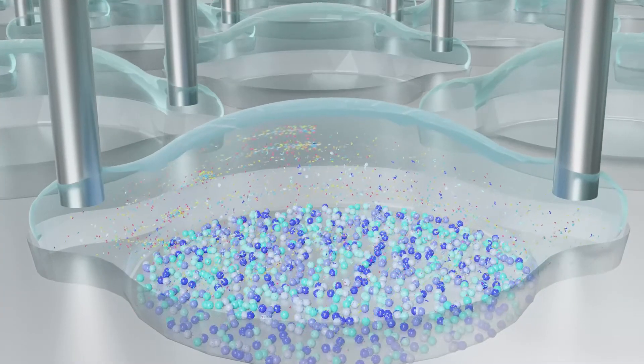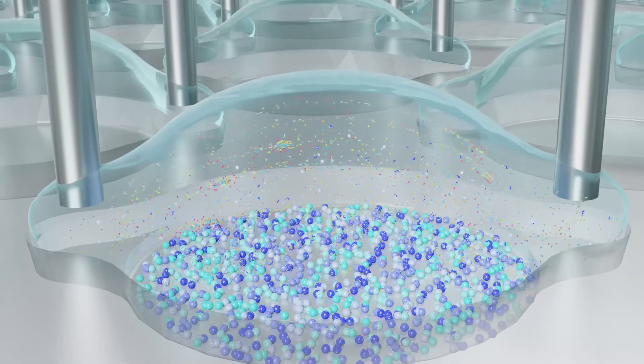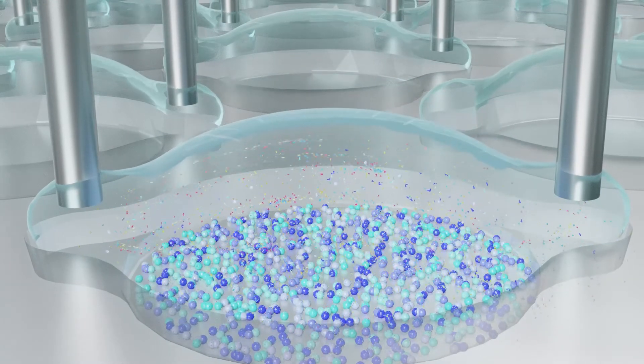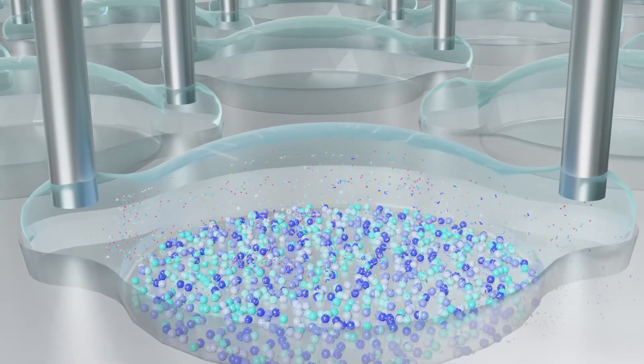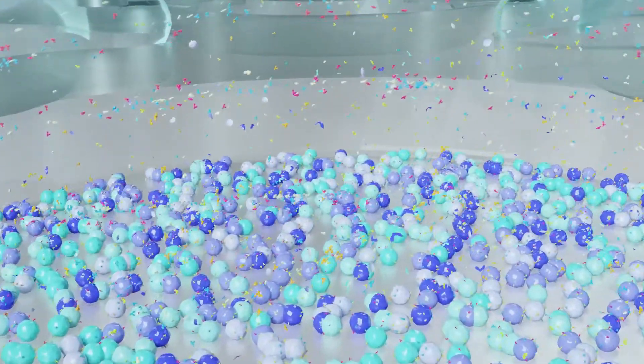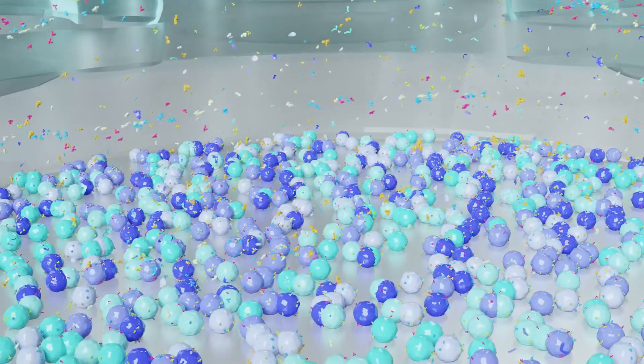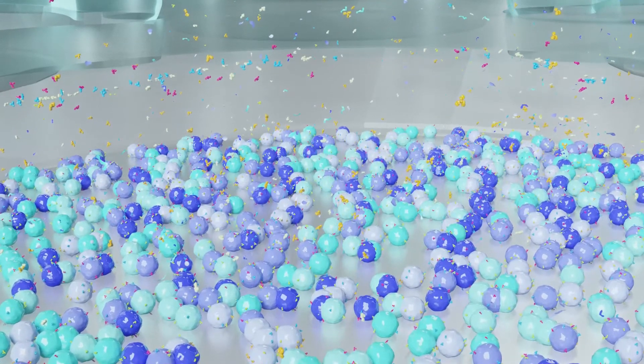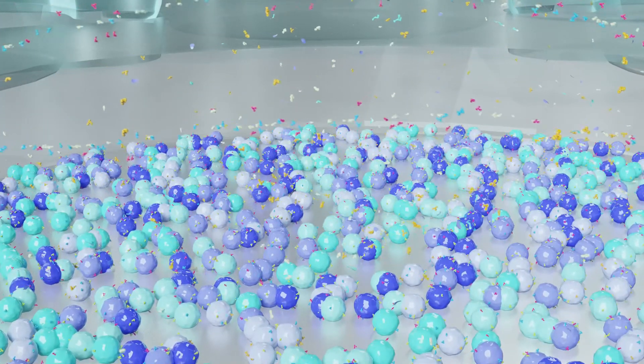The dispensing and aspirating of wash buffer are then repeated for the number of cycles chosen by the user. In subsequent washes, unbound antibodies and small molecules are removed from the cells by diffusion, and the dilution increases exponentially each cycle, providing a thorough and gentle wash.